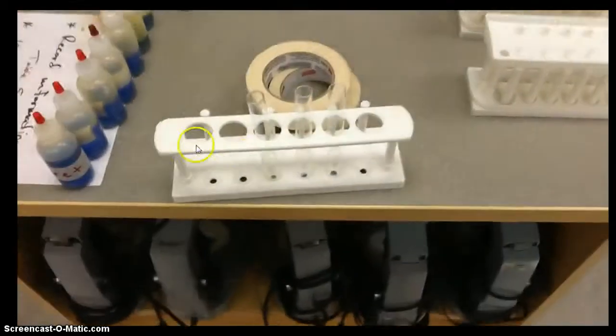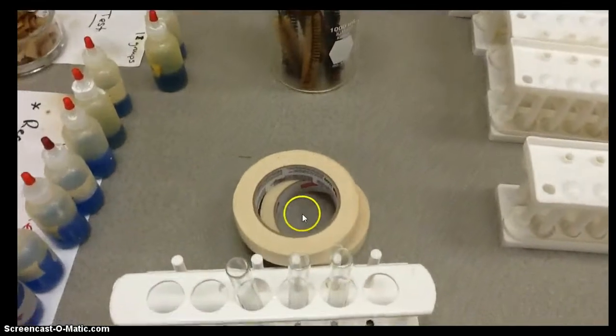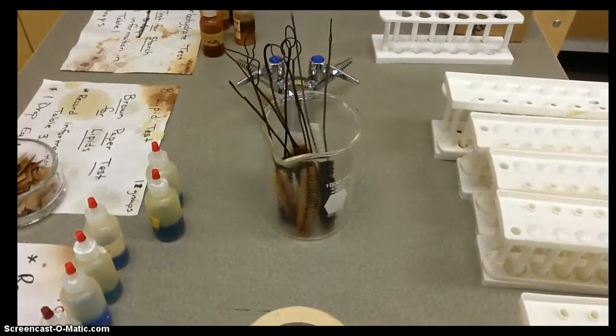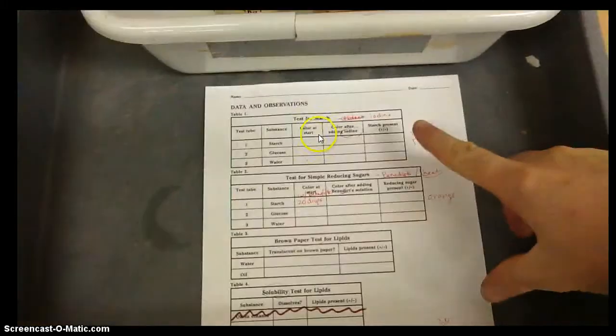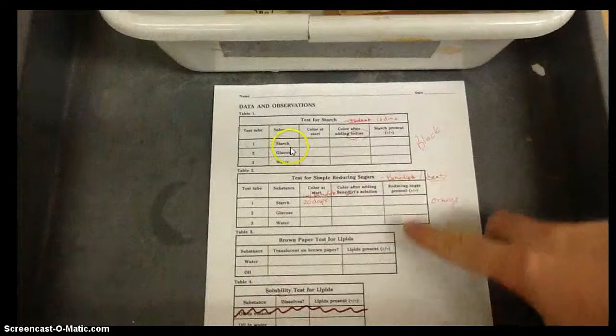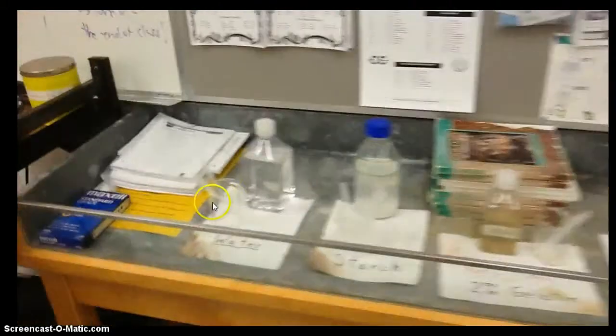Now, each group is going to get a test tube rack with 3 test tubes. Test tubes are going to be in this brown container. Label each one, test tube 1, 2, and 3 with a piece of tape. And you can grab one of these cleaners as well in between different tests that you're going to be doing. Now, we are going to be looking at testing with different reagents. And so those reagents, again, are going to be the starch, glucose, water, gelatin, and oil. And those reagents are all going to be over here on this lab table.